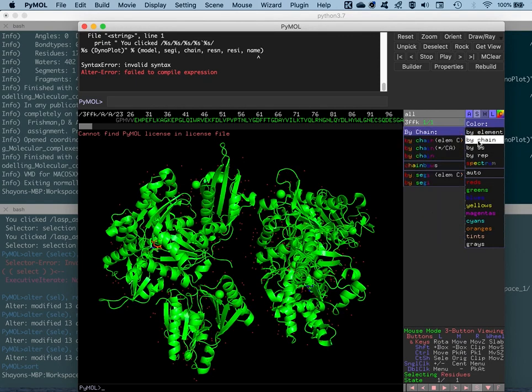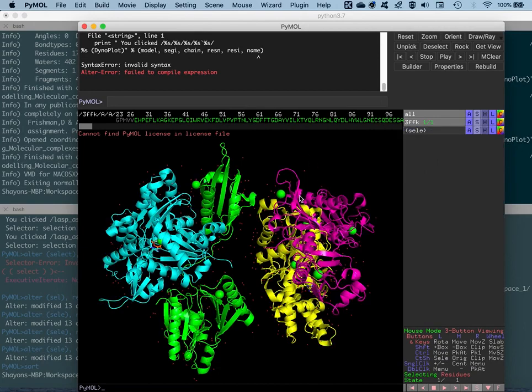So what we'll do is we'll color it by chain first. So let's go for the default option, that's the first one, by chain. It has its default coloring method. And once you press on it, you'll find that the whole structure, including the protein, is colored by chain. So different chains are given different colors, which is A and B for the gelsolin actin out here on the left. So A is for the gelsolin, which is in green, and B is for the actin.